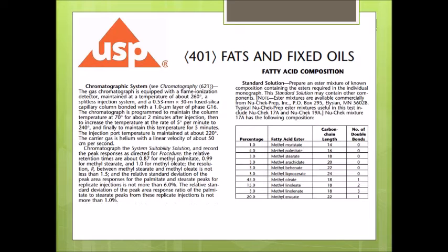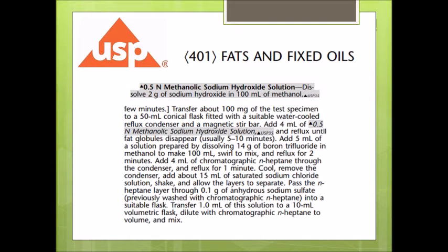And there are oven conditions in this method that you could probably use, and it will work, for sure it will. And also, if you are interested to do the peak IDs, there are standards. I think they are called 17A or 19A. They will have different fatty acids and methyl esters of the fatty acids with different compositions. So you could buy these peak ID standards and do the peak ID if you wish.